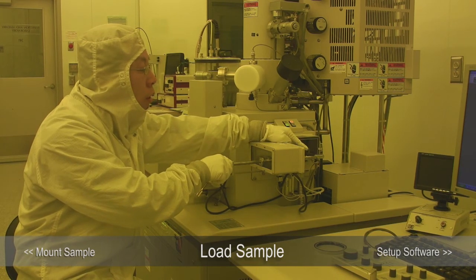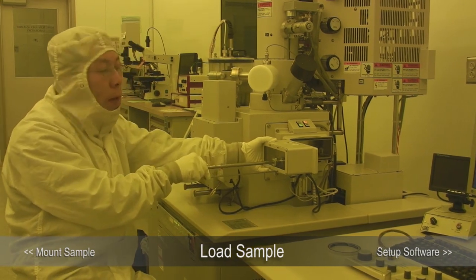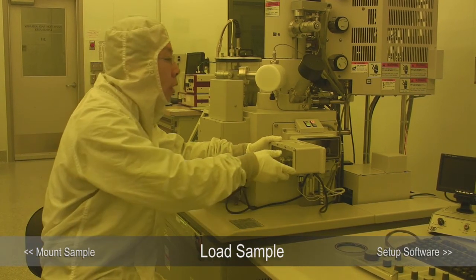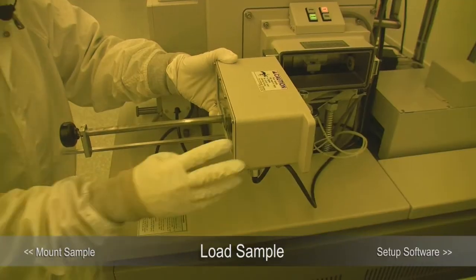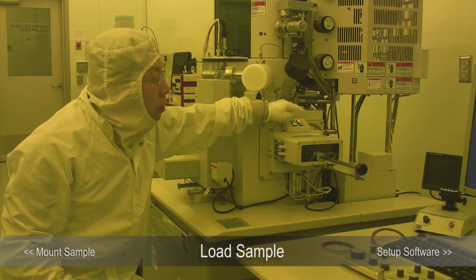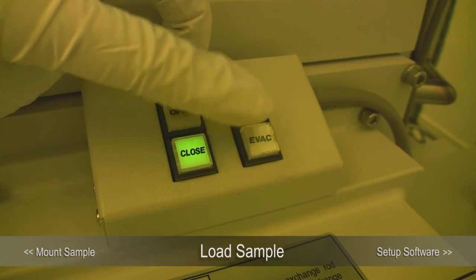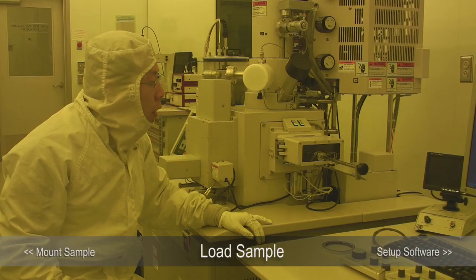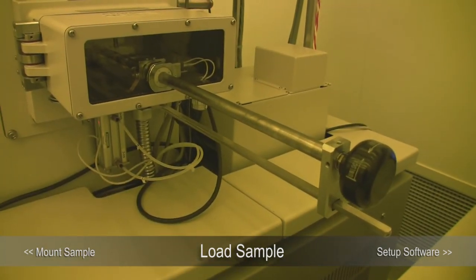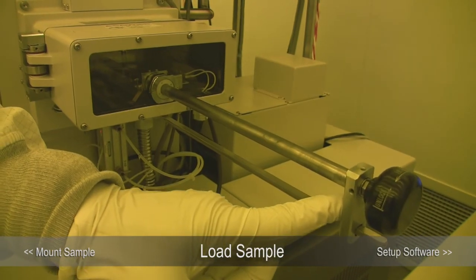After we load the sample holder, we will pull the exchange lock all the way back out. Make sure you pull it all the way back out. I'm going to show you what will happen if you don't. If you don't pull it all the way out and then close the door and press evacuate, the vacuum will suck the exchange lock in. If your sample is larger than your sample holder, your sample is going to crash into the load lock door.